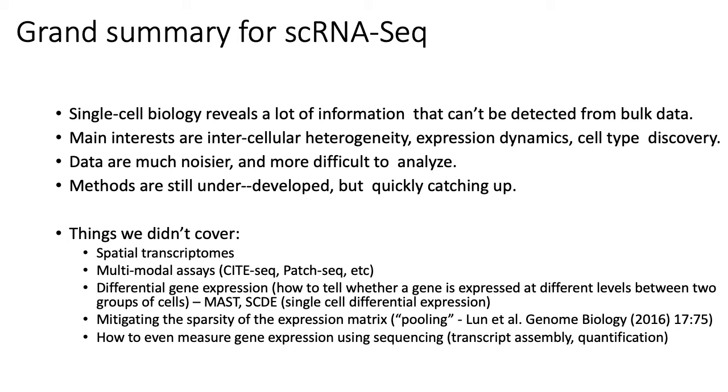Some things that I want to note that we specifically didn't cover in this lecture are, number one, the ever-growing set of single cell-based protocols that measure spatial transcriptomes. And so I said that for a lot of these single cell-based assays that we talked about, one of the first steps that you have to do is you have to dissociate cells from their complex tissues into single cell suspensions. And one of the problems with that is that you lose the original spatial positioning of the cells in, for example, tissues.